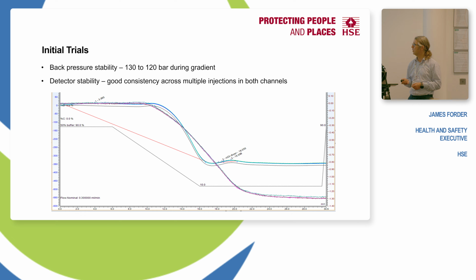And those tiny crystals block the porous electrode of the electrochemical detector. So we have to be very careful in the mixing. Normally when you do a gradient, you'll have your buffer in one vessel and your solvent in the other vessel, and you mix them in the pump, and away you go. If you did that, you wouldn't get good results with this. So I started with two pre-mixed buffers, only 10% different, 50% buffer and 40% buffer.